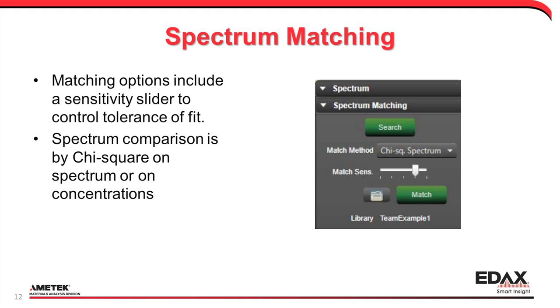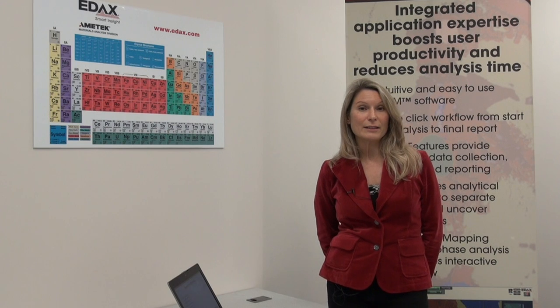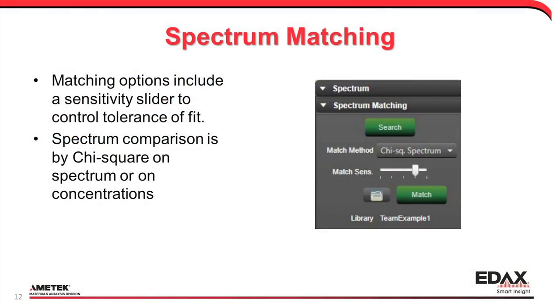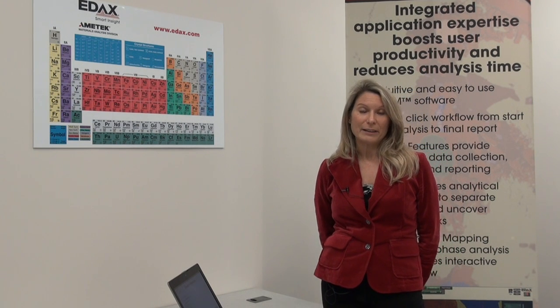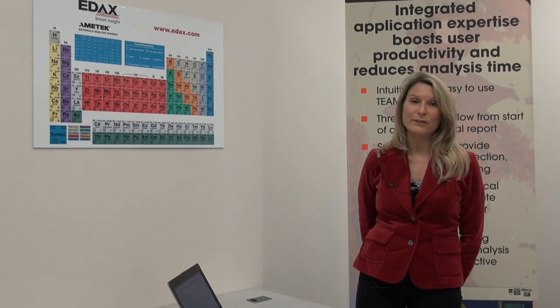The library can also be shared with other sites or different users. The next aspect of the software feature is that you use that library as a basis for comparing subsequent unknown spectra. You collect a spectrum from an unknown material, click on the match button, and it will show you what your spectrum matches and what your fit tolerances are. When you do a spectrum match, the unknown spectrum is referenced against the library you built, and it pulls up the closest matches, overlaying them on your unknown spectrum and providing a fit tolerance based on how close or different your unknown is to the materials in your library.